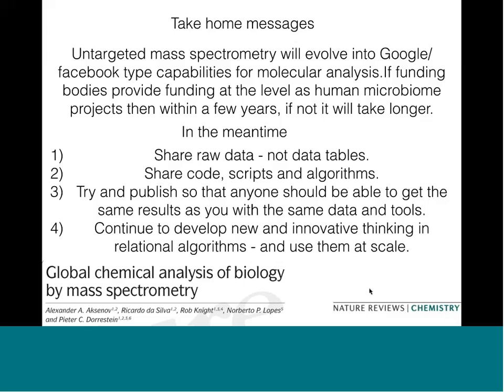But in the meantime, to enable this capacity in the future, we need to share raw data and not data tables. There's a discussion in the field that data tables should be shared and not raw data. I disagree with this. With data tables, you can no longer inspect the raw data if mistakes were made. And the comparison to this is the Protein Data Bank.